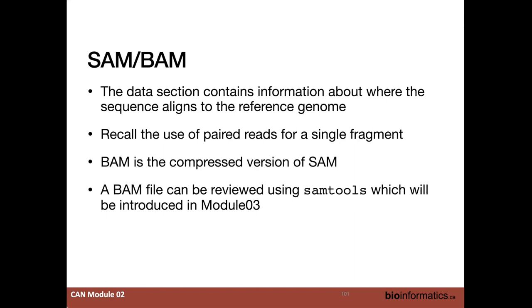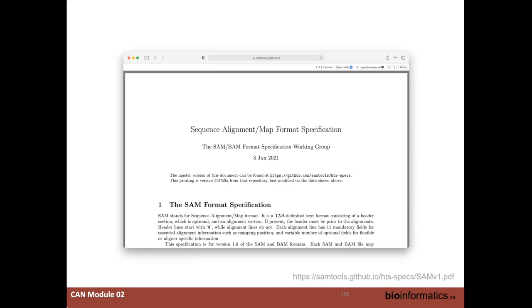You'll be doing a lot more with it. You can't just zless a BAM file; you'll have to use specific tools designed for it, and you'll be using these tools in module 3. One of them specifically is SAMtools. I'm just throwing it down here because, depending on how much time you have, you'll be doing some laboratory work with that. If anyone's interested, you can take a look at the specification, which is found online. I put the link there for you.